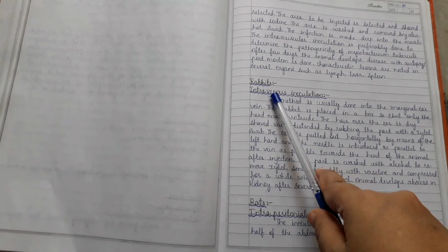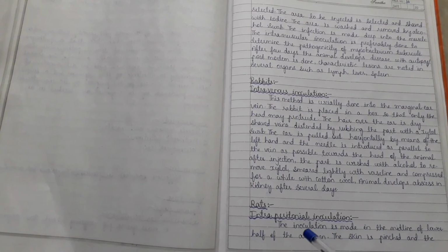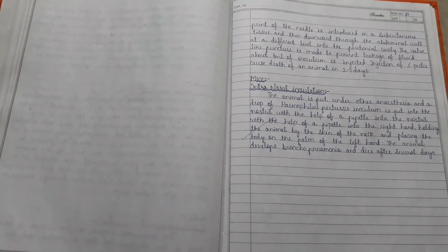Whereas coming to the rabbits, intravenous inoculation is used. Coming to rats, intraperitoneal inoculation is done. And coming to the mice, intranasal inoculation is used.